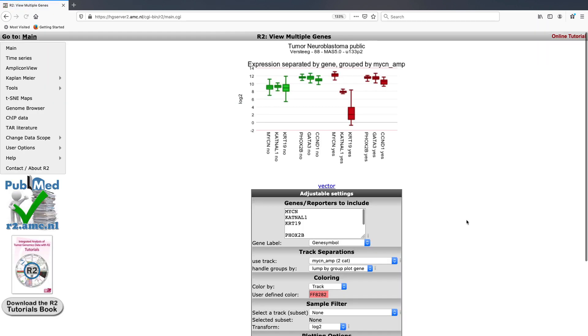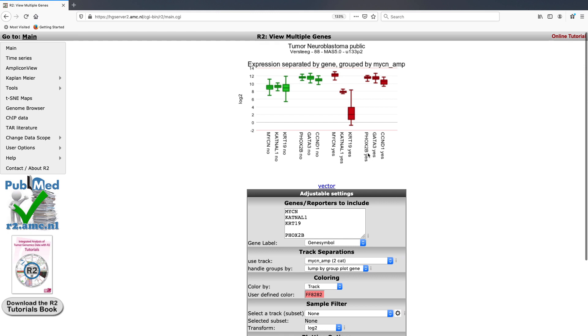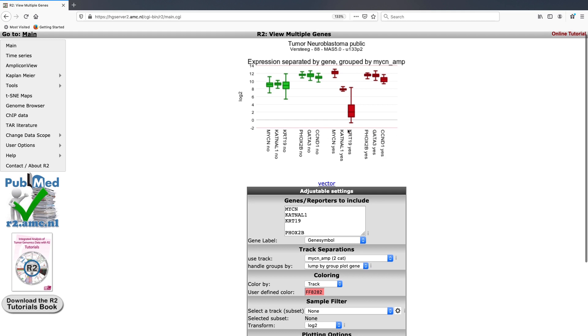Here what you can see is that you now have the non-amplified and the amplified or MYCN non-amplified and the MYCN amplified tumors as two separate groups, but all in the same plot.